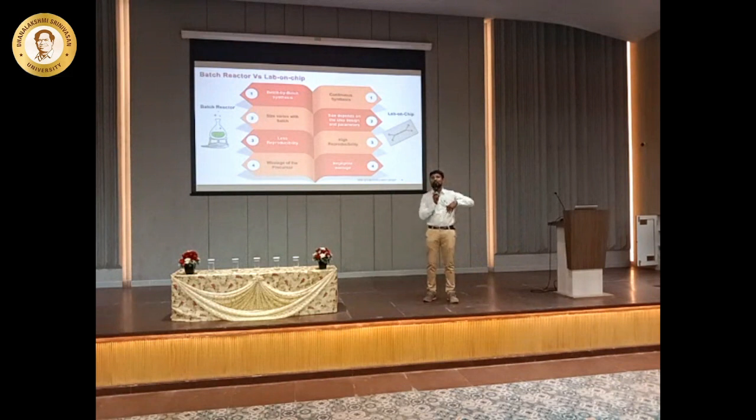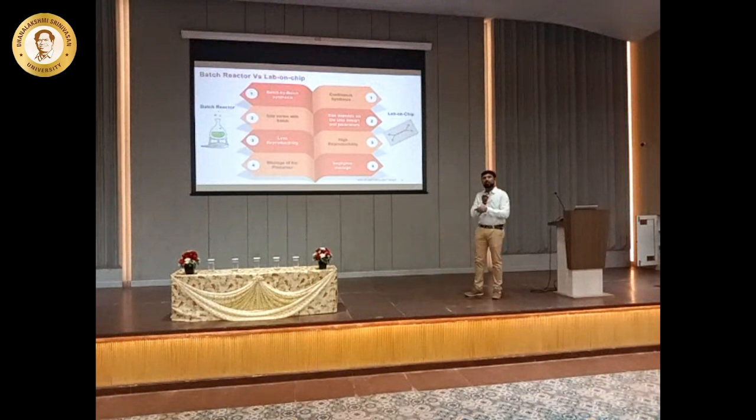Or if I want to scale up from, say, 1 milligram to 10 milligram, again you need to increase the concentration. There is a problem again when you want to make these nanoparticles, because you cannot play with nanoparticles just like making a biryani from a smaller pressure cooker to a bigger box, right? It's not possible. So there are always a lot of factors involved here, and that challenge can be overcome. It can be made better when you bring in lab-on-chip technologies, right?